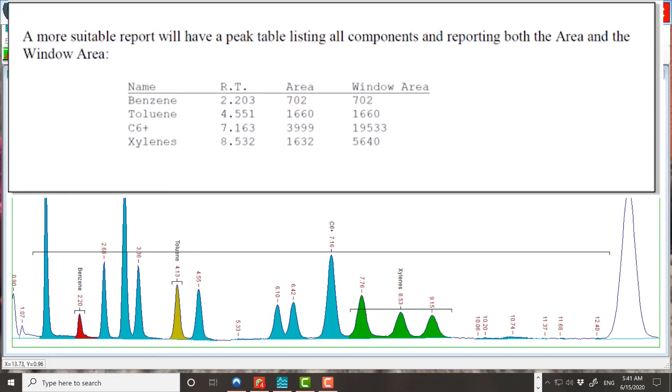In the case of xylenes, this includes peaks 17 through 19. In the case of C6 plus, this includes peaks 6 through 25, except for peak 7 benzene, peak 12 toluene, and peak 17 through 19 xylenes.